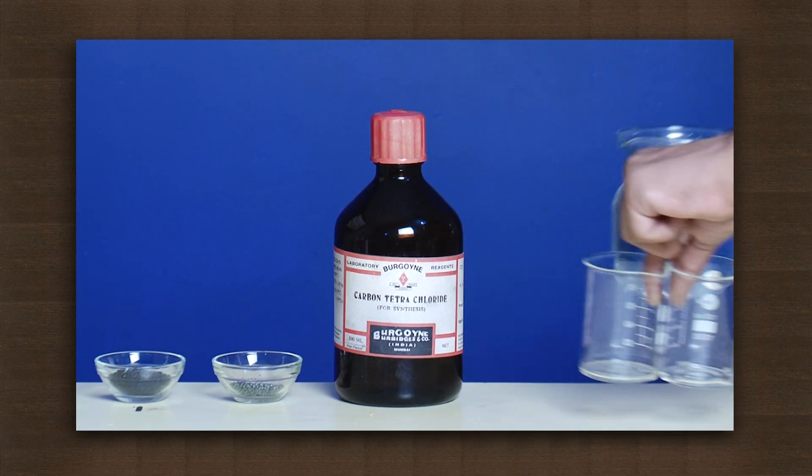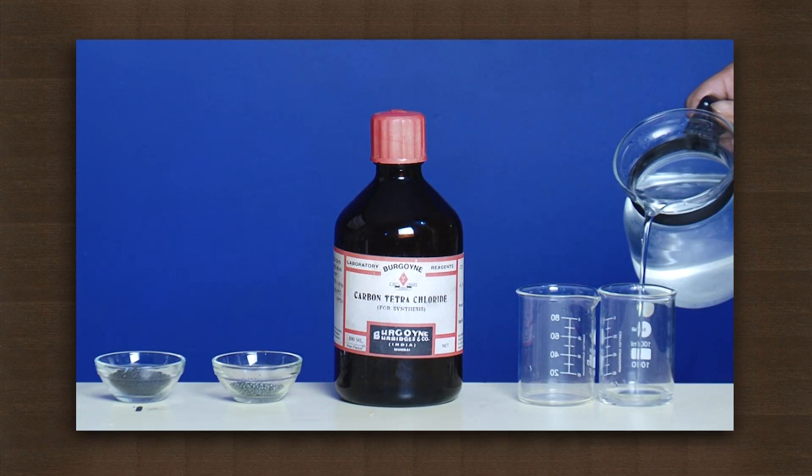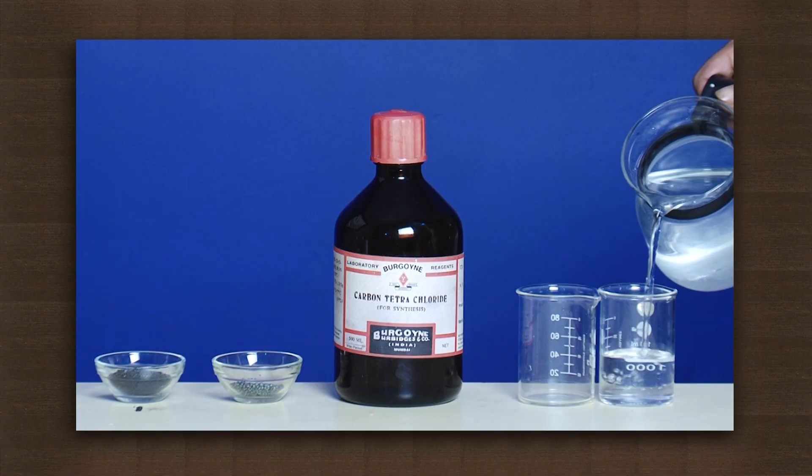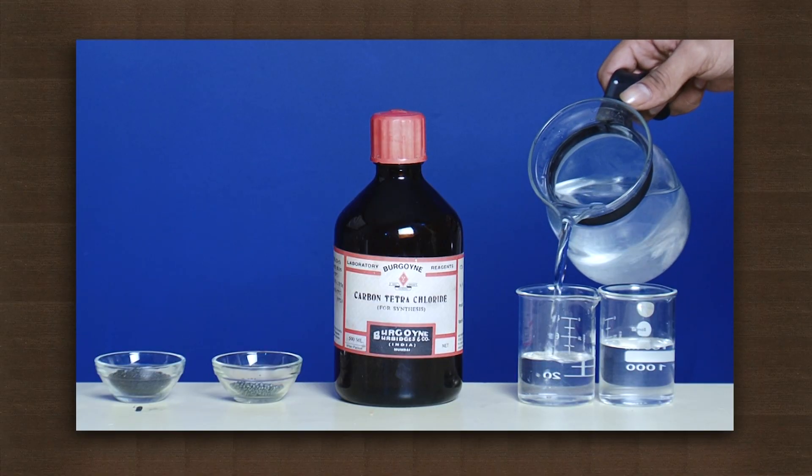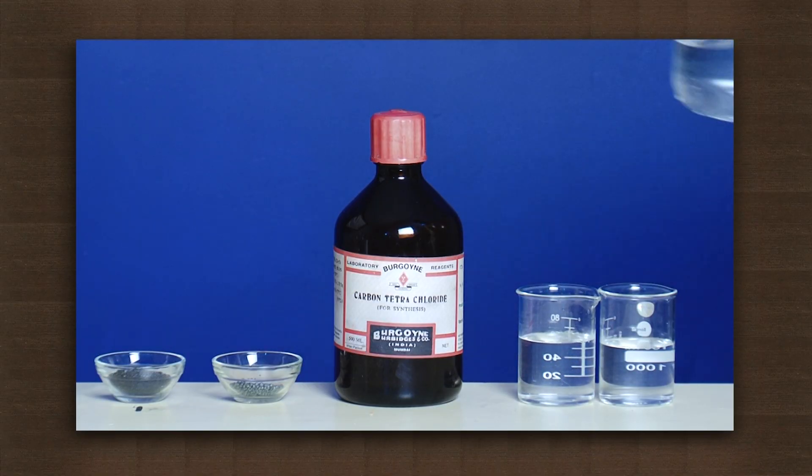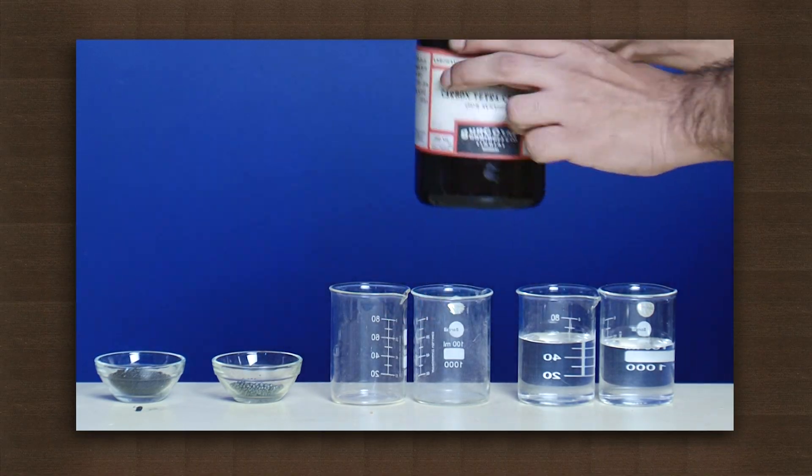Take two beakers and pour equal quantities of water in them. Now take two beakers and pour equal quantities of carbon tetrachloride in them.